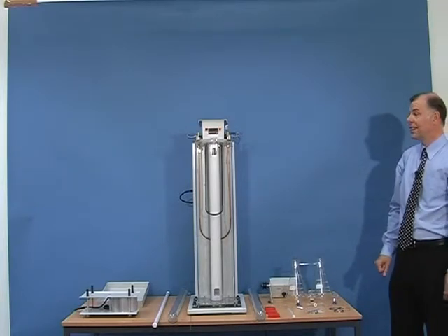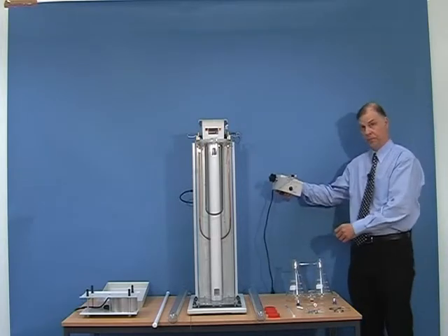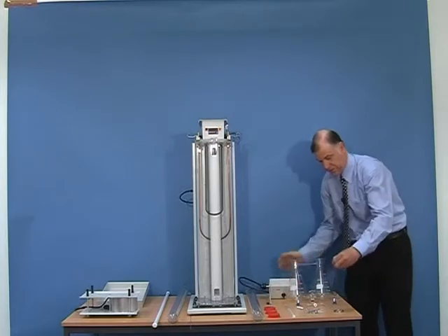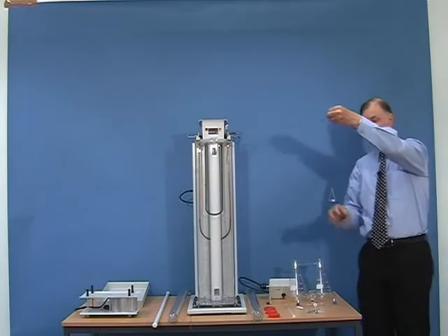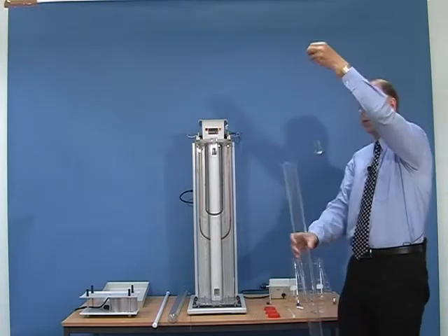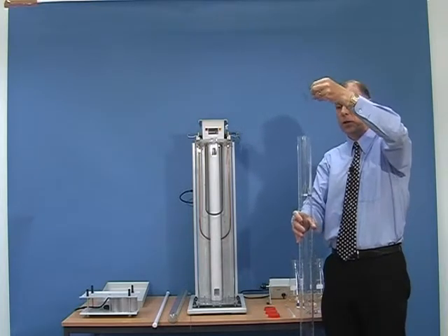To introduce the floats into the column, we have a column sweeping mechanism complete with a basket. We will place the floats into the basket, and this will be lowered very slowly into the column once the column has been made.